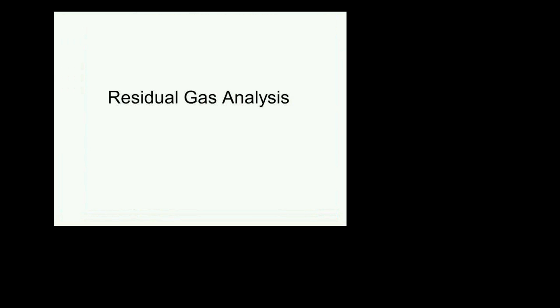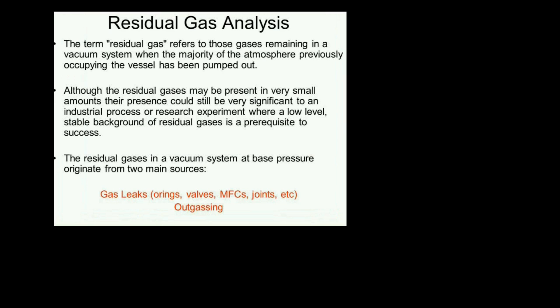There you go, residual gas analysis. And so the term, as we mentioned before, residual gas refers to those gases that remain in a vacuum system when the majority of the atmosphere previously occupying the vessel has been pumped out, right?